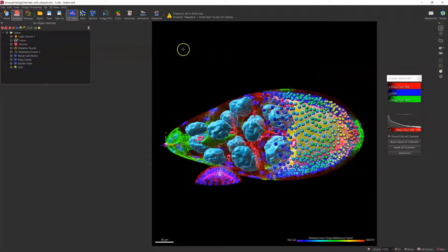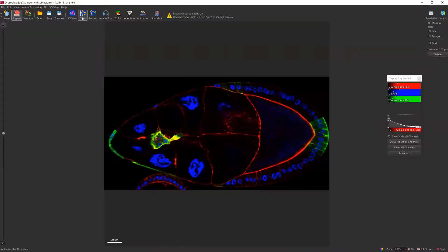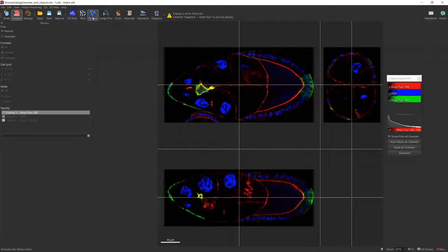The Snapshot tool can be used not only under 3D view, but also slice view and section view.